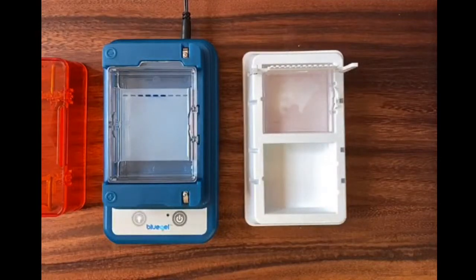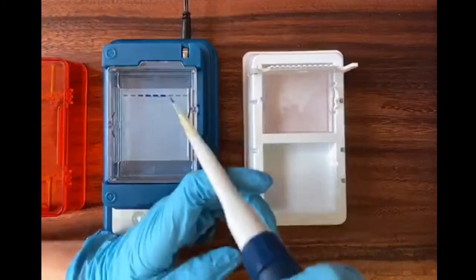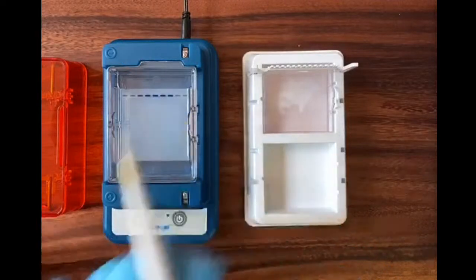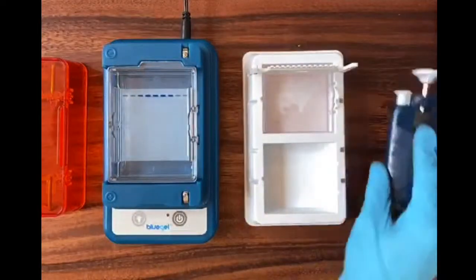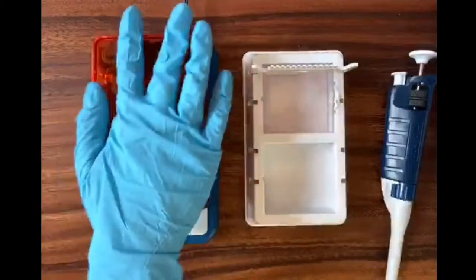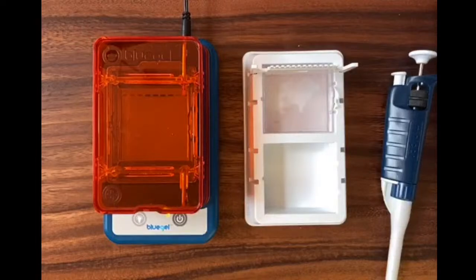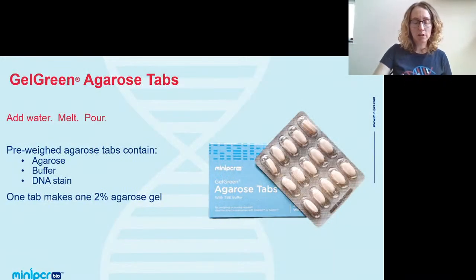But so far, so good. What I'm seeing right now, if you see how there are four wells that are darker than the others, those are the wells that have patient sample in them. If you see that nice rectangle of color of loading dye, that means you've done a good job. You haven't injected your sample through the side of your well. So good. We are five for five. We are ready to run our gel. So I'm going to put the lid on now and hit the power button. My light goes on. That's good. My gel is going to run out now. So I'm going to give it a few minutes to run, and we can talk about some other stuff in the meantime.